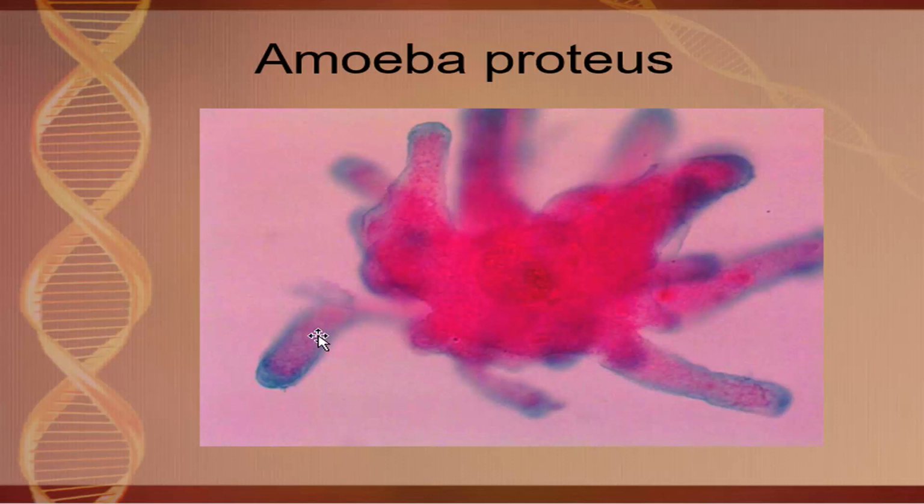They have these little structures here called pseudopods. And that's how they move. Inside the amoeba is the cytoplasm, because it's a single cell. And they can push the cytoplasm into these pseudopods to help them move. It's called cytoplasmic streaming.